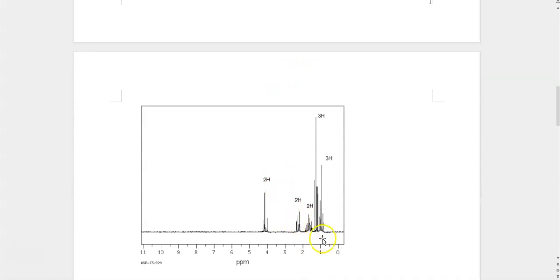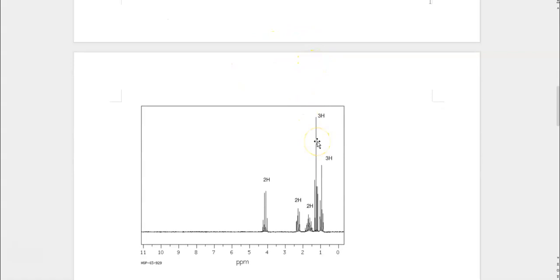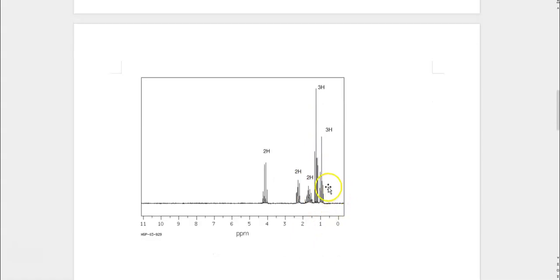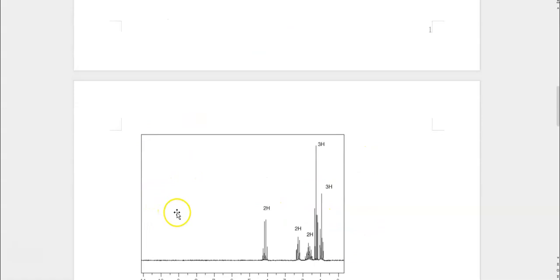And then you have these 2, which indicates there is a triplet and a sextet, which means that there is a carbon that is right next to these 2 structures right here. And then you have the methyl groups, which are very proximal to each other in the 1H NMR spectrum, and that is because they are both methyl groups, which will appear on both ends.